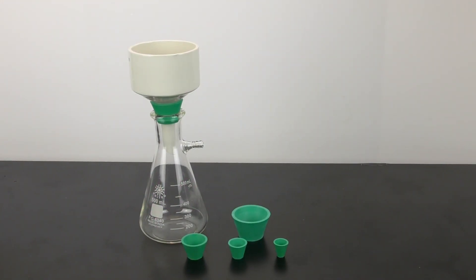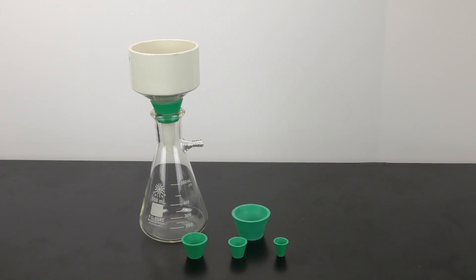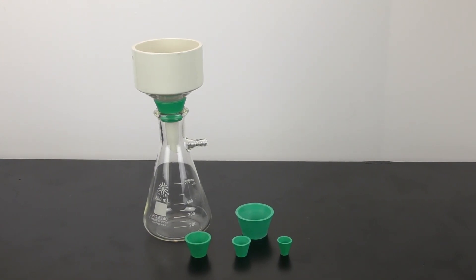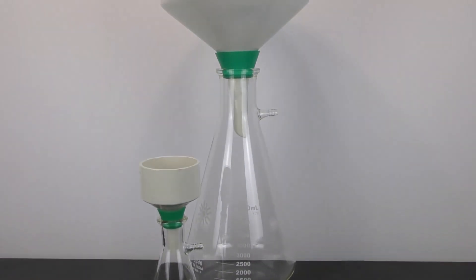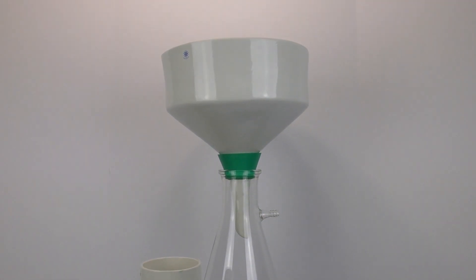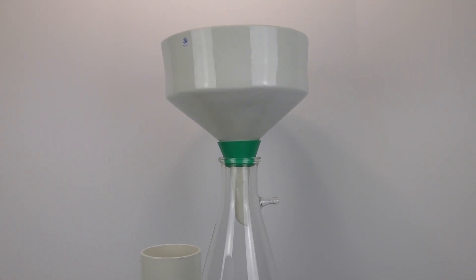With the 7 different sizes that come with this set, you are sure to find something that will fit any possible experiment that you can set up, whether it is this small filtering class experiment, or if your needs are a little bit larger than traditional sizes, you can also accommodate these large scale filtrations as well.